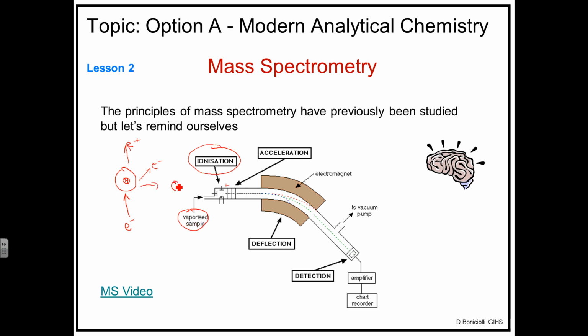So the atom is an ion. Ionization. As soon as the ion is produced, it gets accelerated through to these negatively charged plates, and so that's why this region is called the acceleration region, and there is a little gap there in the plates. Most of the particles hit the plates, but quite often particles come through in a nice, neat, focused beam of ionized particles.